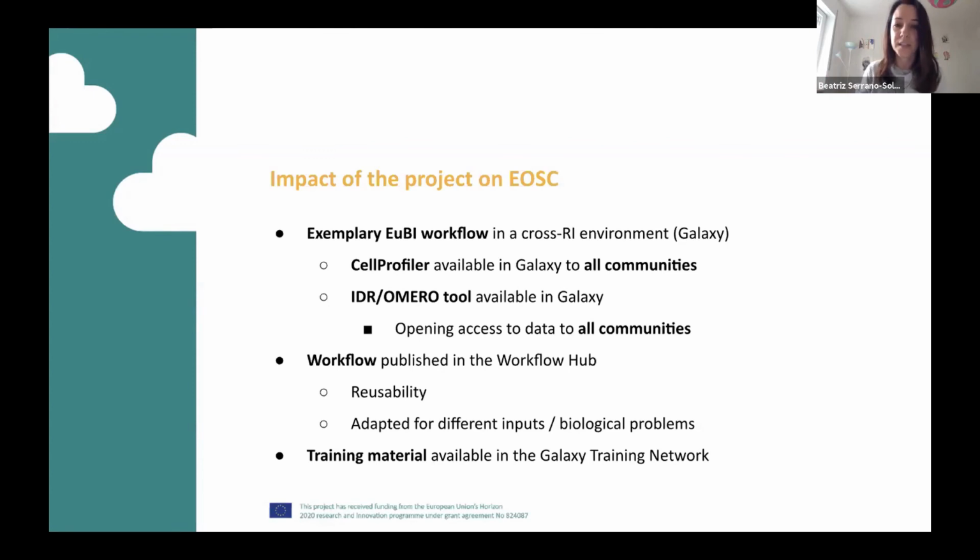So having CellProfiler available in Galaxy makes it useful for other communities that are maybe starting to add imaging into their own analysis. The same for the IDR and OMERO tool, in which we are now opening access to this data to people from different communities, not just imaging.